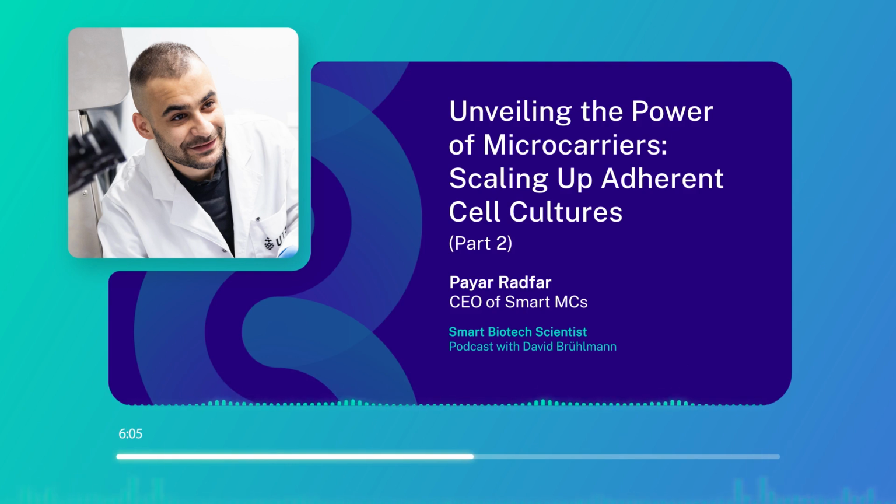And then there's been a trend of use of smaller bioreactors, but many of them in parallel simultaneously, and novel technologies like microfluidics to do different monitoring or different types of cell culture process have been among the hot topics in a sense. I think these will probably be the next level things that we would be expecting to come.